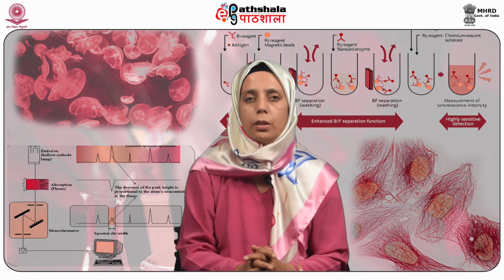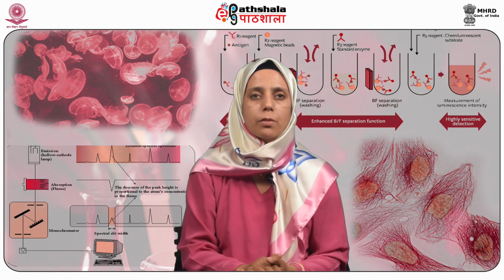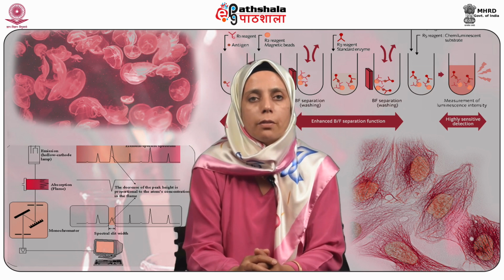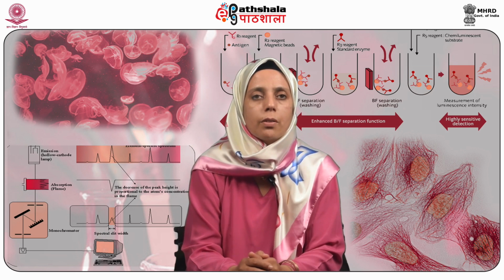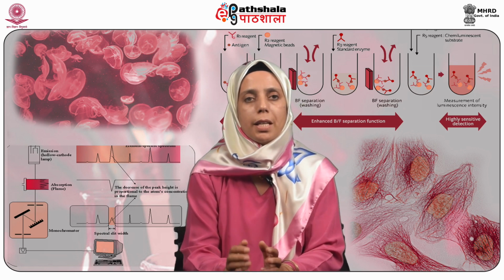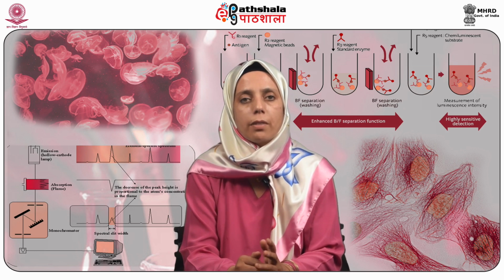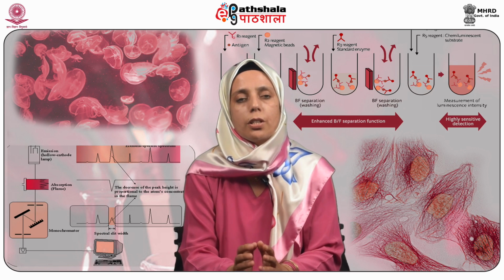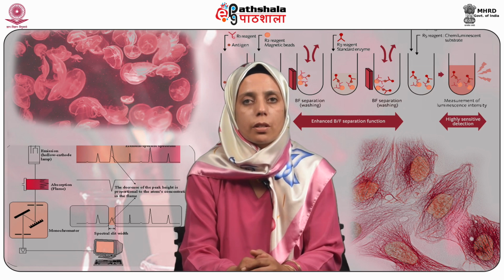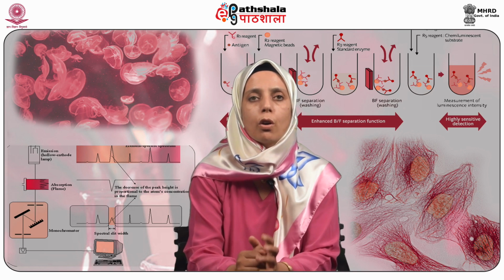We already know that atomic absorption spectroscopy is based on absorption by atoms or elementary ions. The components of a sample are converted into gaseous state or elementary ions by suitable heat treatment in atomic absorption spectroscopy. These atoms then get excited and the absorption is measured at a selected wavelength, which is characteristic to each individual element. The absorbance of the gaseous mixture serves for qualitative and quantitative determination of one or more of the elements present.